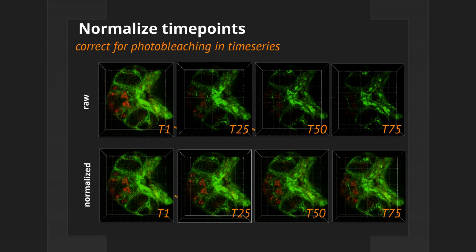Okay, lastly, I know there's quite a few people in the room that brought tracking data to me yesterday, so I have a feeling there's a lot of live cell trackers. Photo bleaching can be a real nightmare for people who are trying to track something through a period of time. In some cases, people are not necessarily tracking intensity, they're tracking motility, they're tracking migration, they're tracking morphology changes. Those things all require you to be able to see the intensity in order to get the right measurements.